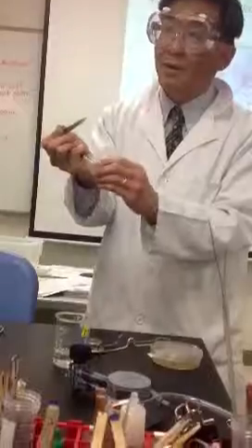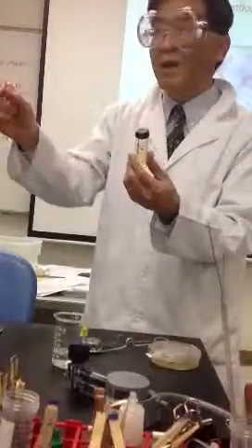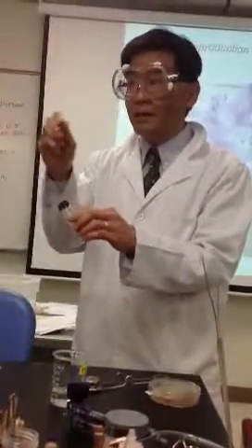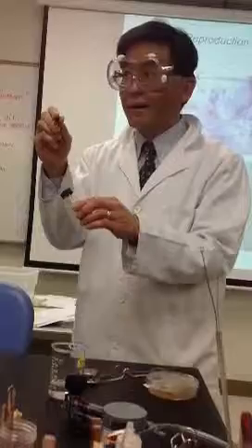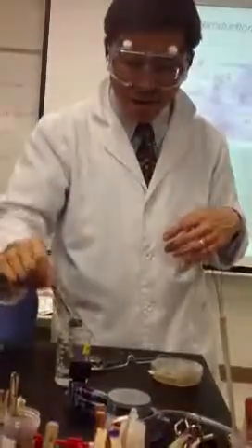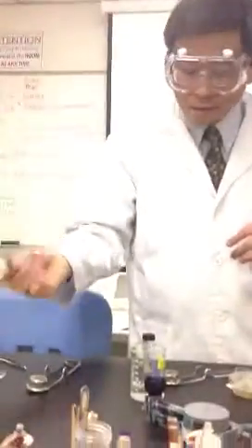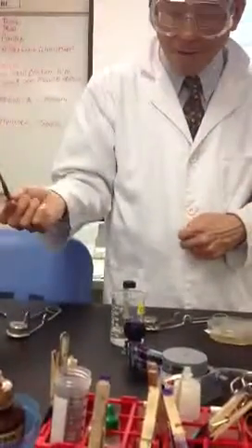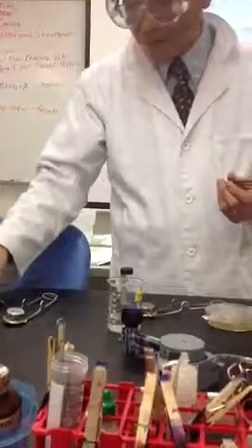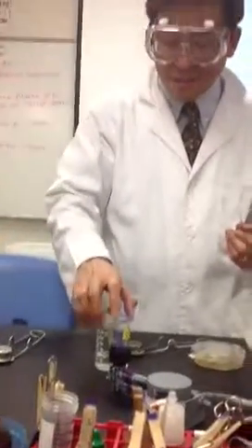Did you put it face down? This one, because I'm just basically grabbing the mold directly, I'm just going to stick it. It doesn't matter, but you want to be touching the surface. If you do have gel, make sure the mold side is down. Before you do anything with this, you have to disinfect, to flame it. Flame it and keep the flame away from the beaker, so you don't have a nice little beaker fire, like setting your garbage can on fire.